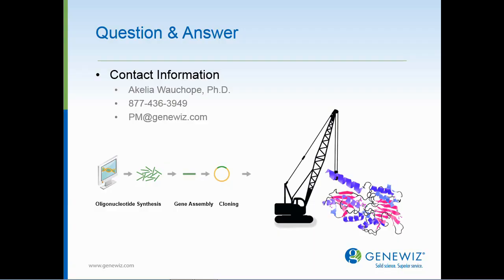Great question. Although the gene may consist of 75% GC content, we would really need to take a closer look at the sequence, since we want to know how distributed the GC content is across the entire reference sequence, as well as consider factors such as, are there direct repeats within this region? Does it consist of an inverted repeat? And basically, what is the overall distribution of this complexity? With that being said, although the gene might be branded as being a bit complex, it does not mean that the gene synthesis will actually fail.